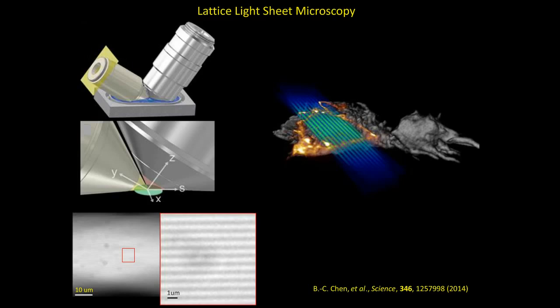So there is not enough space, and we customize a 5 mm cover slip, so you can see the working area is very small, and we put the sample, such as a cell, C. elegans or zebrafish, on the focal plane. If you look at the focal plane here, we put the dye solution inside. You can see all the light sheets. Now we can create 100 beam light sheets simultaneously, and each beam has a separation of around 1 micron. This is really good, because now we can improve our imaging speed and reduce photo damage.